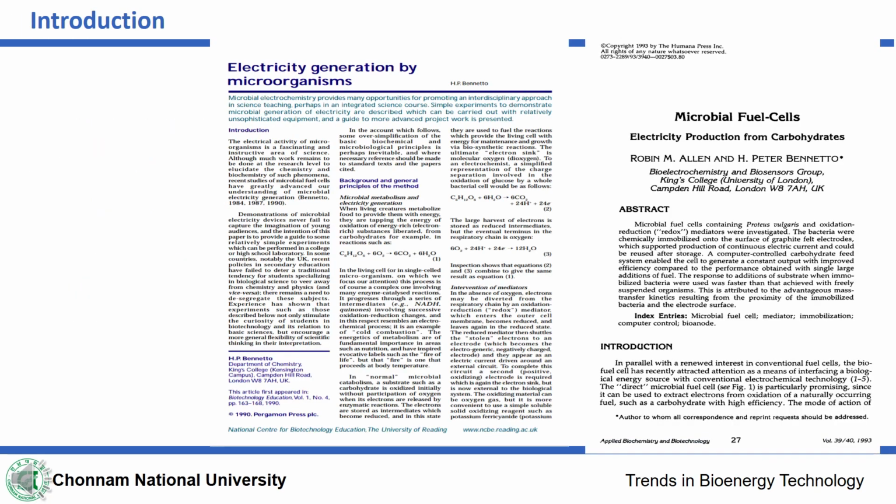The two manuscripts cover the topic of electricity generation by microorganisms. This is a fascinating idea. Studies have greatly advanced our understanding of microbial electricity generation. Today we will see how a microbial fuel cell is assembled and works to generate electricity.